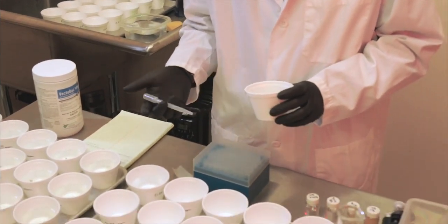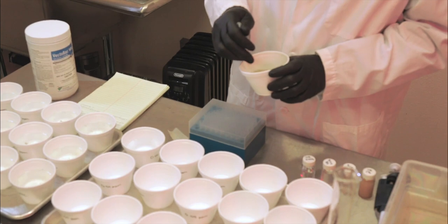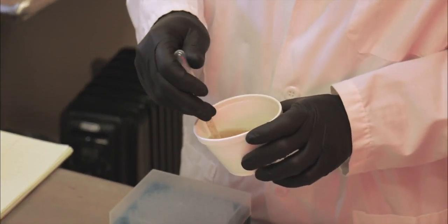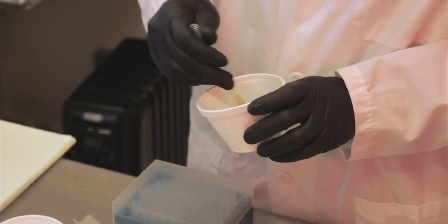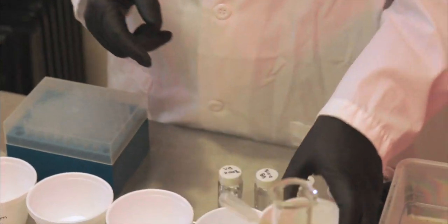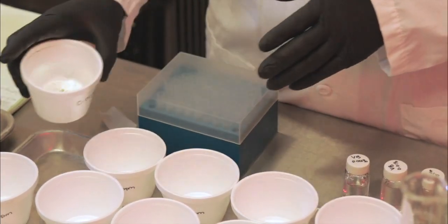So what's the amount we believe is best for this system? We make a 10% suspension of rabbit pellets, or you can measure your water volume and weight of pellets and make it around 10% and soak it for 20 or 30 minutes. Then you stir them up to make a slurry. Then you take the slurry, taking an even part if possible, and add it to the cup. A couple of, 3 drops for that. Oh, actually 4 drops. After you add that, you can see the cup is still very clear, and it looks like not much is going on here with the larvae, water, and the food particles.